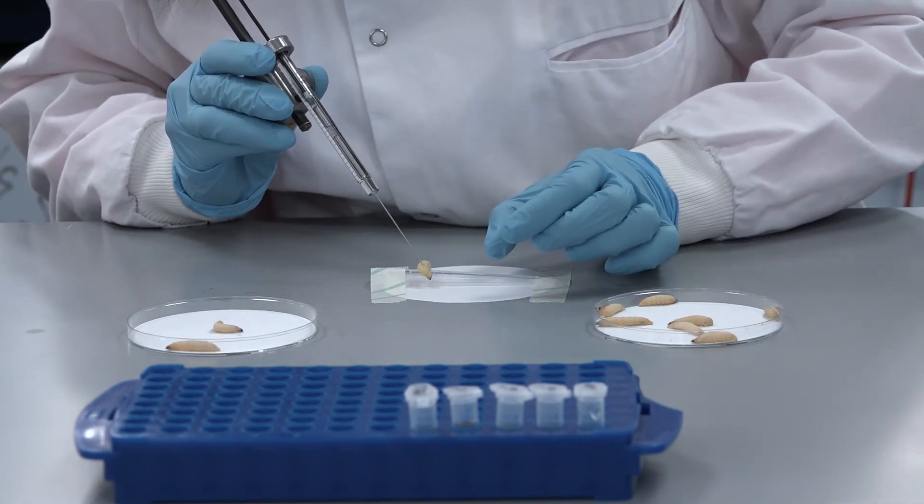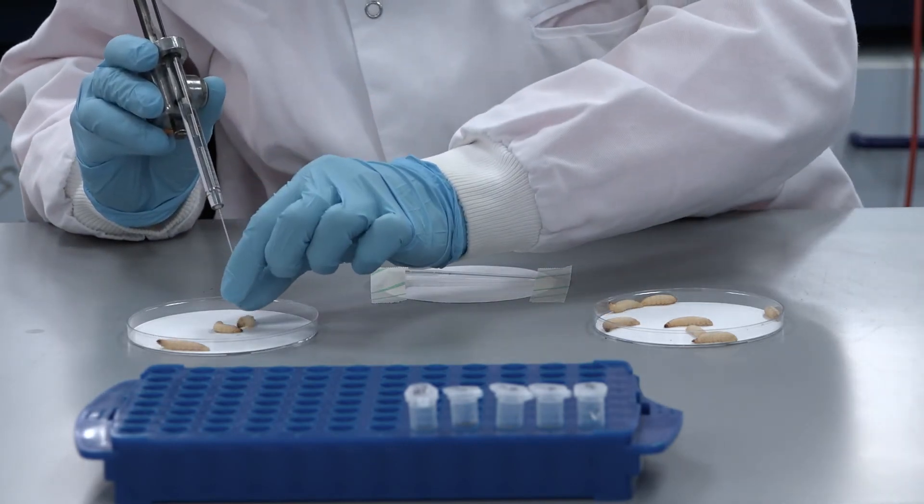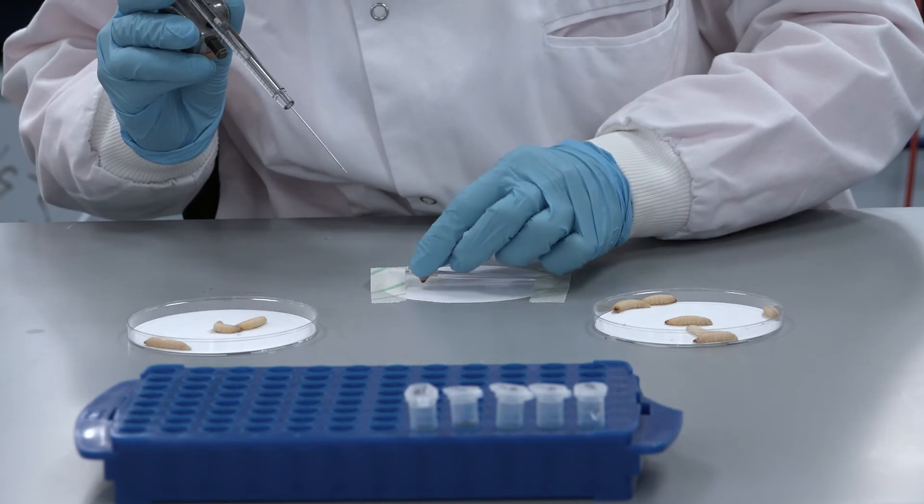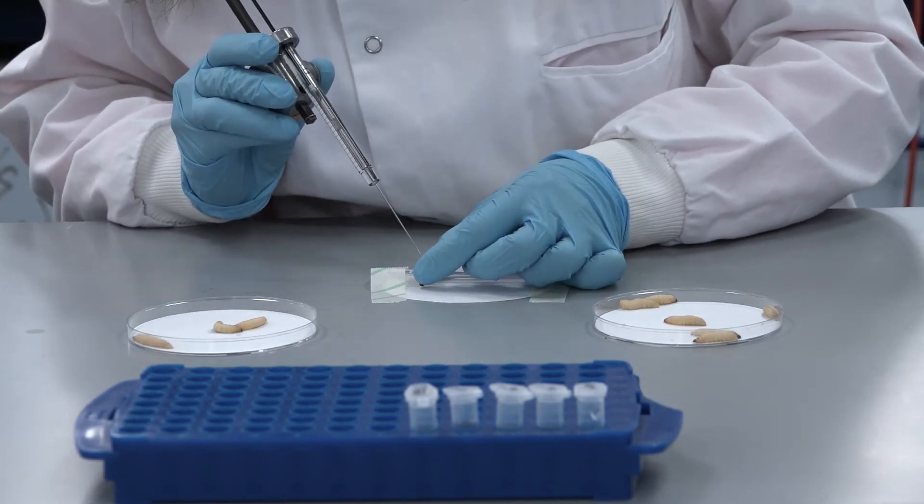In addition, set aside 10 TrueLarv Galleria melanella as no injection controls, and 10 larvae should be injected with PBS as an injection control.